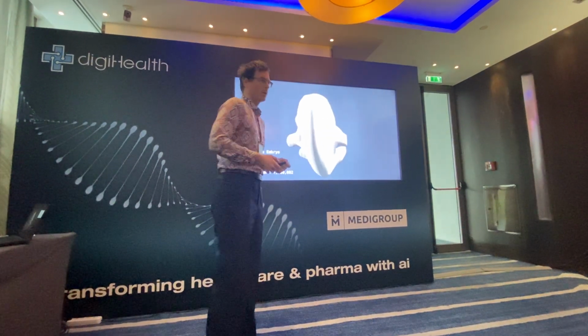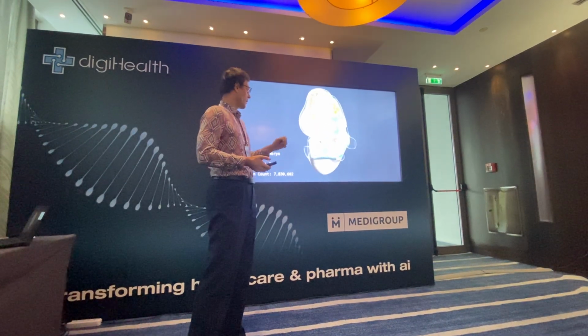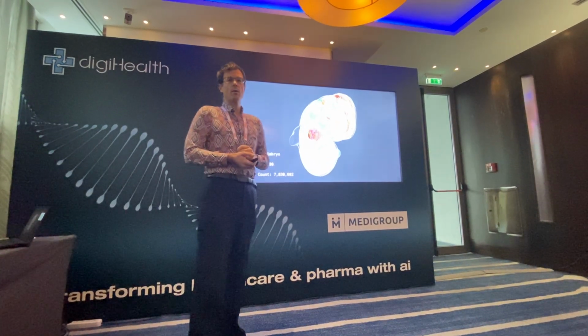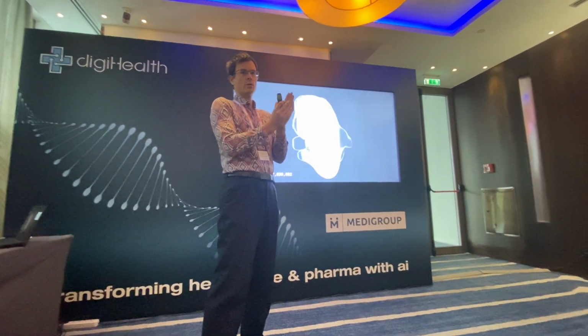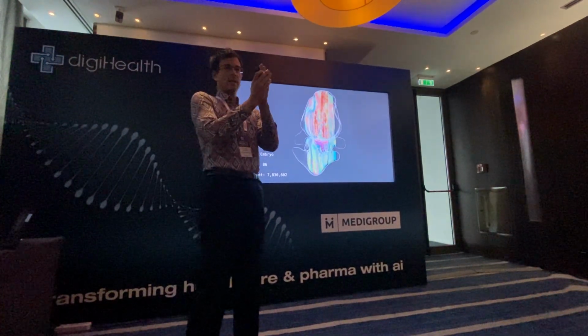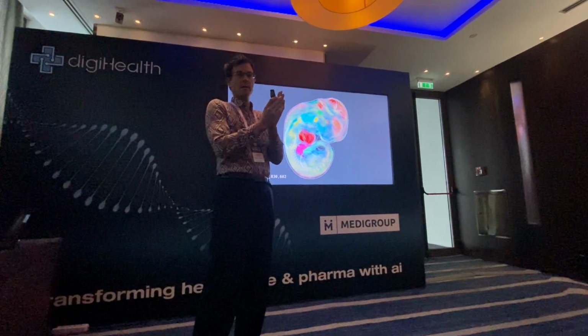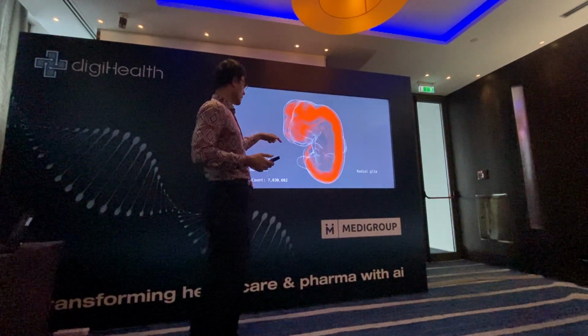Another example of what you can do. The previous one was temporal dependence, and here you can obtain also spatially consecutive slices of the tissue, like what they did here. So 86 consecutive slices were sequenced, and we performed experiments on each of them and reconstructed cell types.